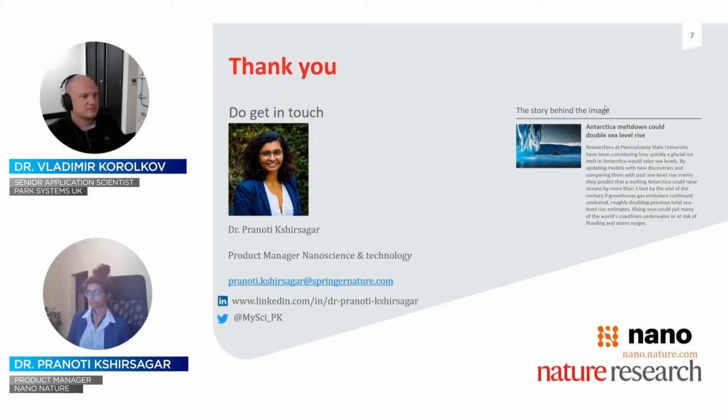Excellent. Thank you for that, Vladimir. We've got a question here for Pranoti as well. So Pranoti, how often are articles added to the Nano database?